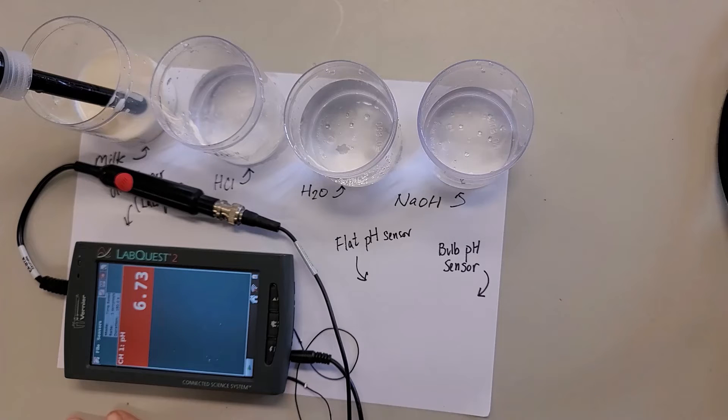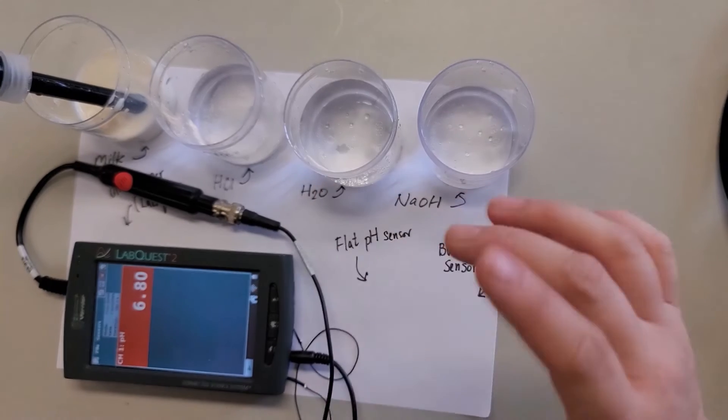So for milk, we expect it to be slightly alkaline. Let's wait for a bit to stabilize. So that's how we use the flat pH sensor. And then moving on to the next part.